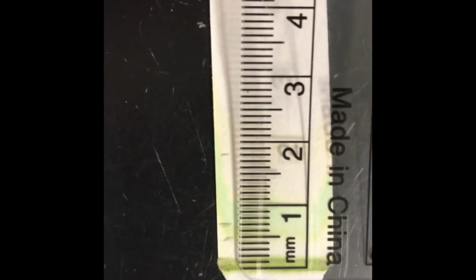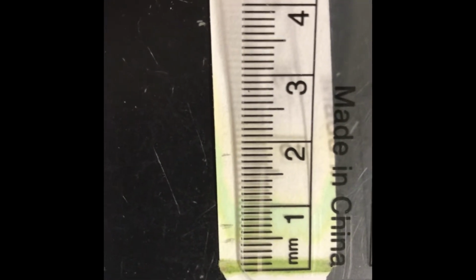All right, so you guys ready? This is your first measurement. Okay, so we're going to go, let's see, I guess I should go like this. Silly goose. All right, there's the base of your pigment. You're going to the first pigment line. To me, it looks like 5 millimeters.